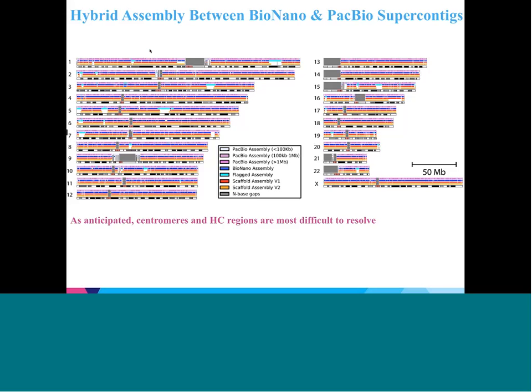If the sequence assembly had a strong disagreement with the BioNano genome map, in this case indicated by more than 10 mismapped markers, we ended up throwing away that particular contig. In many cases, this is overly aggressive, largely because in the sequence assembly you'll get errors at the end of the contigs, but also because we have different structural variations, which we'll come back to at the end.